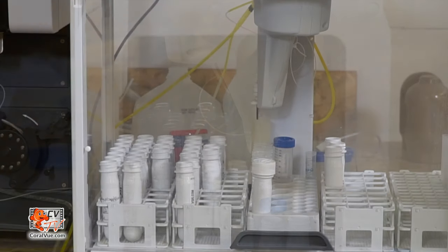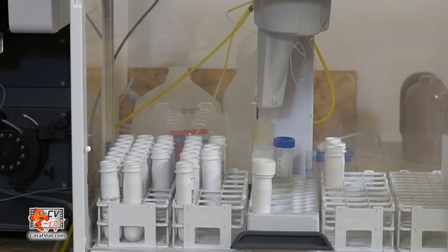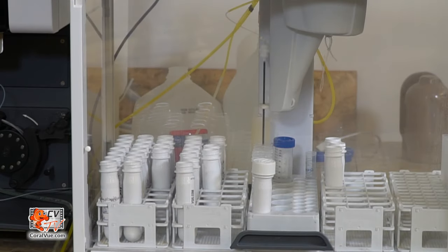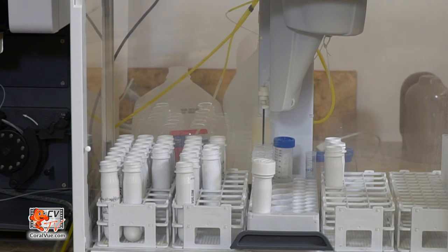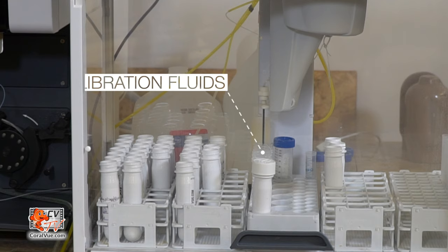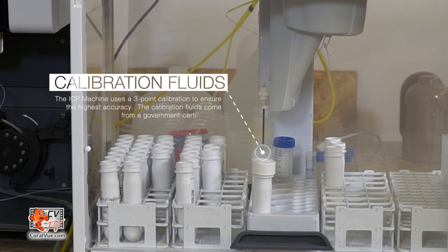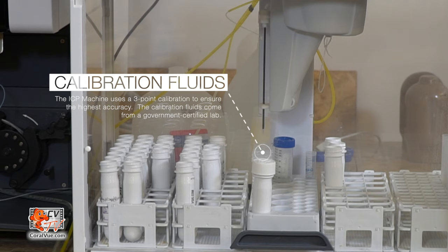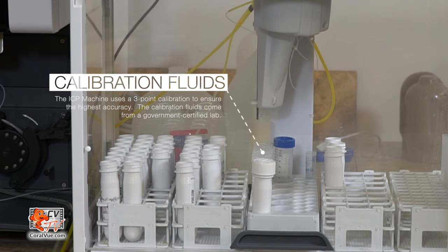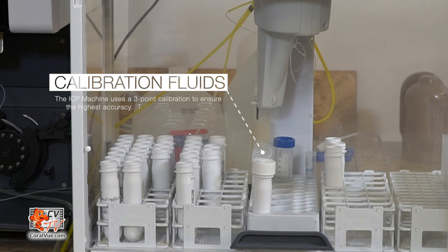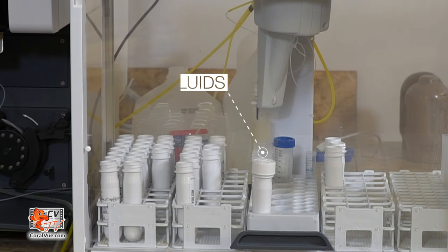The ICP machine uses a three-point calibration method, which is executed every nine tests. The probe draws water from three different calibration solutions, which come from a government-certified lab, ensuring that every test is as accurate as possible.